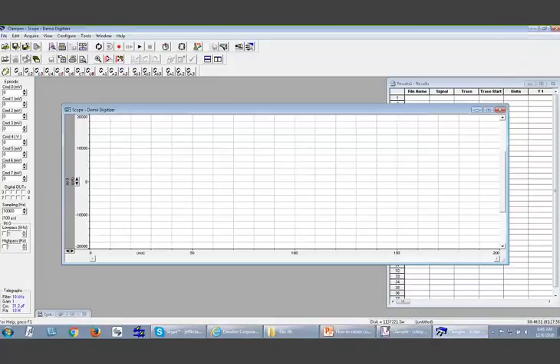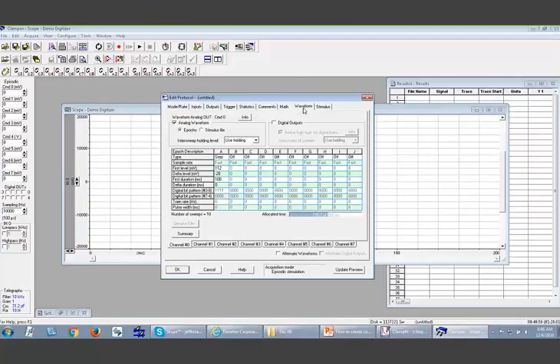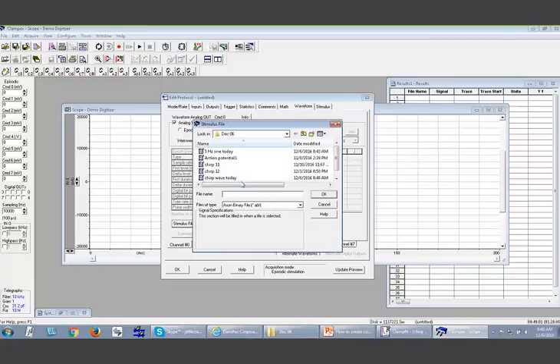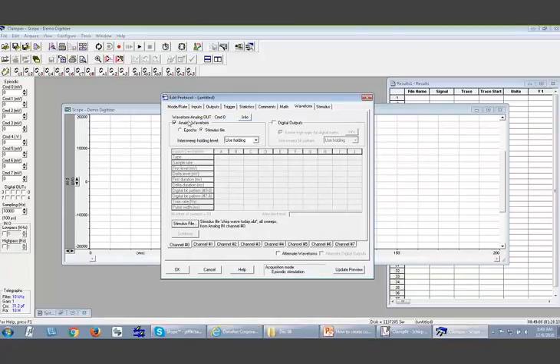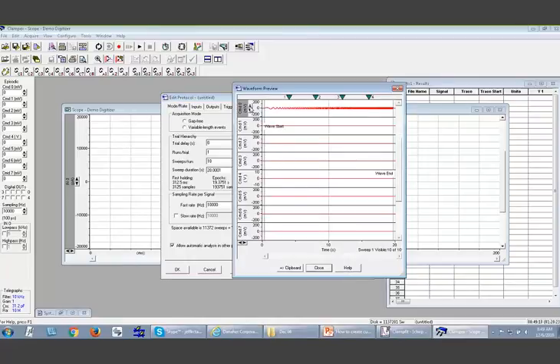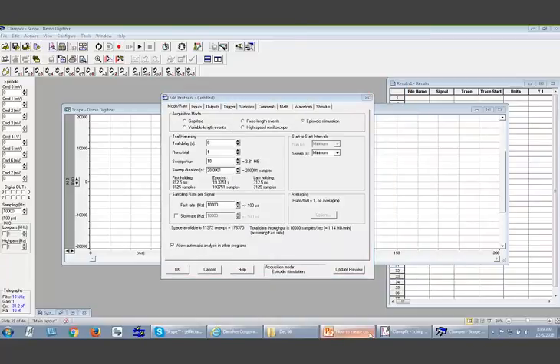Now you can go back to Clampex, go to Edit Protocol, Waveform tab, check this stimulus file, click here. Now you can see the Chirp wave, ABF format, and hit OK. Now make sure that the duration is correct, 20 seconds, and update preview. You see, is it beautiful? Yes. Right. All right. So let me get back here.